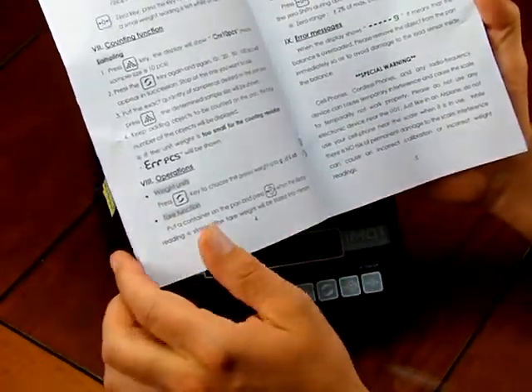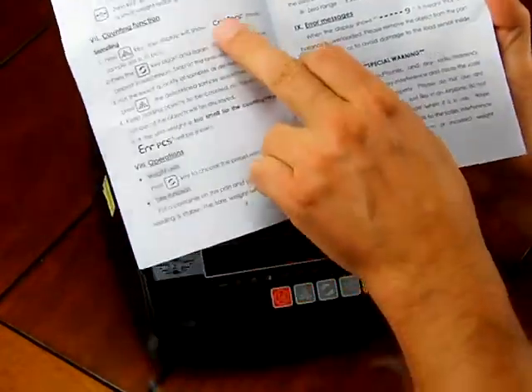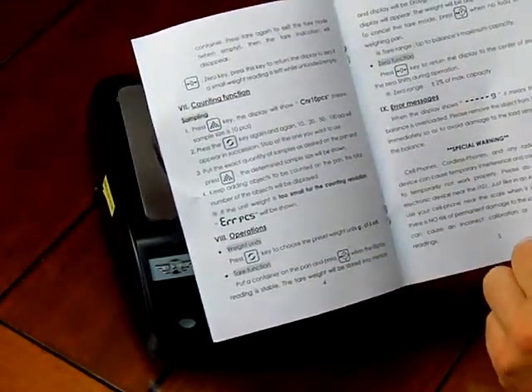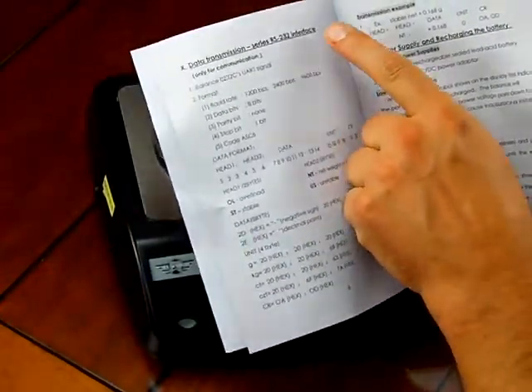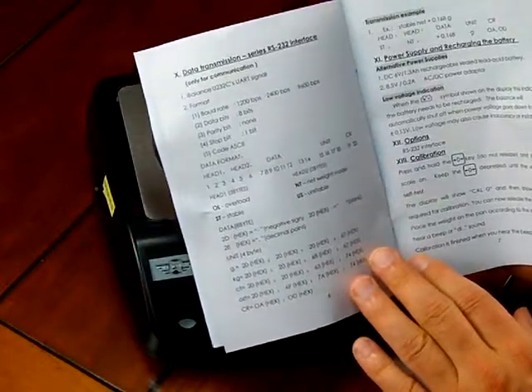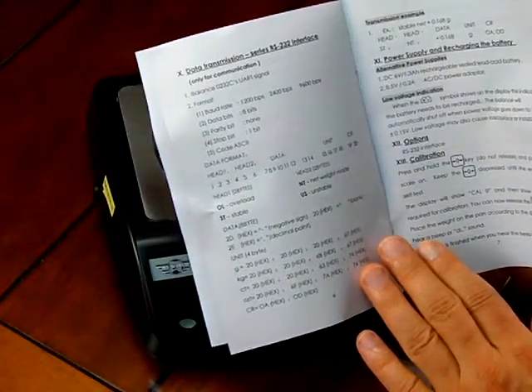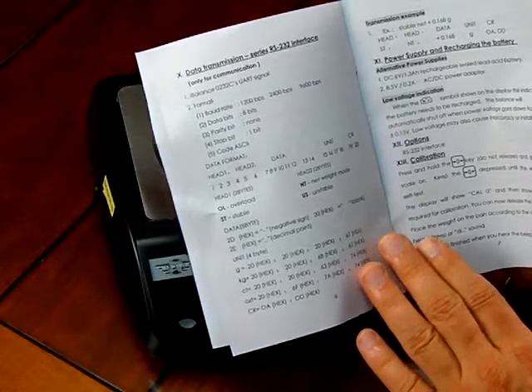So it is a basic portable scale. It offers features including an explanation of the keypads, a counting mode which is a nice feature some people might use, and it does have an RS-232 interface. We're not going to support it — we can't be on the phone supporting how to interface the scale to a PC, and there is no RS-232 cable included. The majority of customers buying this scale really aren't interfacing it with a PC.